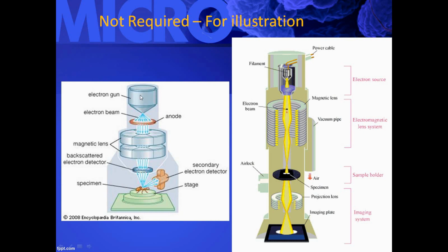Okay, so the electron microscope produces an electron beam that passes through magnets that focus it onto the specimen. Then these electrons hit electrons in the specimen and generate secondary electrons that are knocked out from the specimen. The secondary electrons leave the specimen and reach the secondary electron detector, which is the camera system inside the scanning electron microscope.